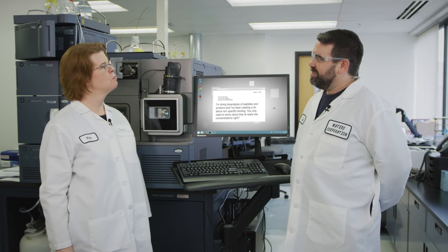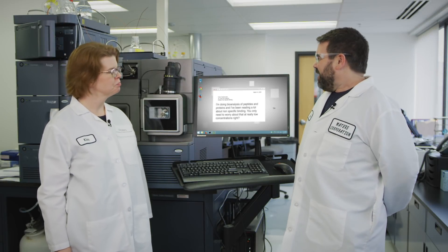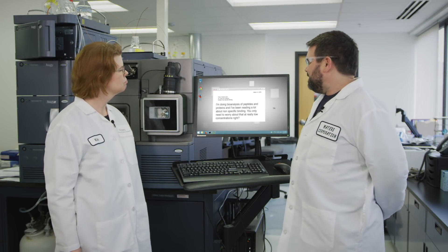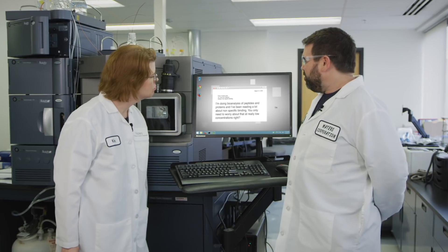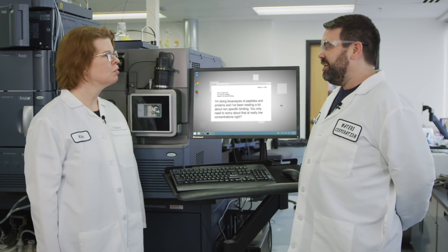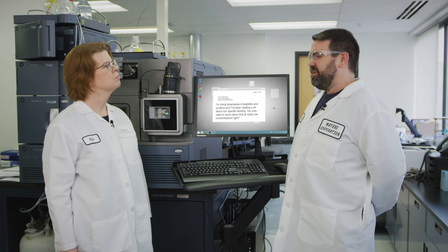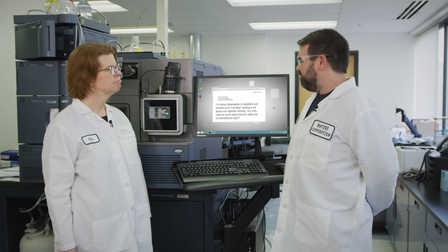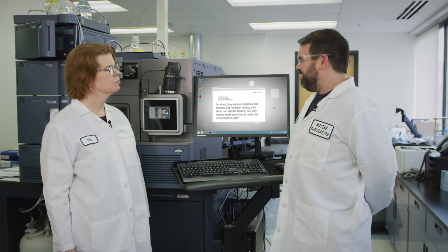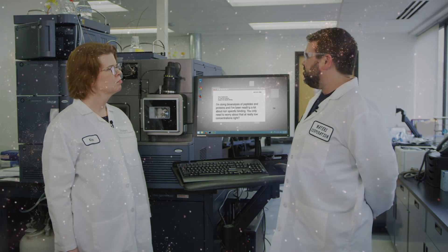Hey JT, what do we have in the inbox today? We got a good one that just came in from a scientist doing protein and peptide analysis. They're concerned about nonspecific binding, and in particular asking if you need to worry about that if you're using high concentrations of sample. We know it's a problem at low concentrations, but they're specifically asking: is it a problem at high concentrations?